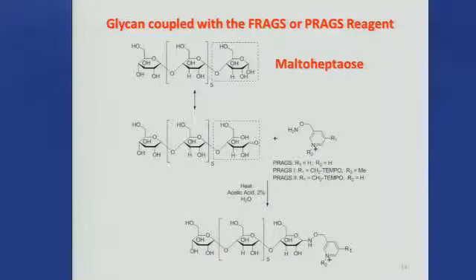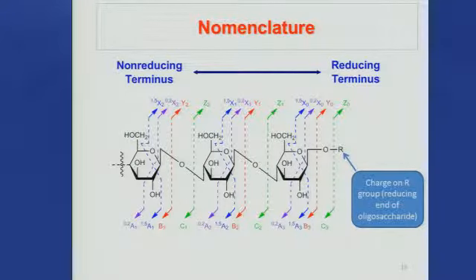So how does this work? We take our reagents, we couple them to the glycan, and in this case, we're just taking maltoheptose as an example. And then isolated in the mass spec, singly charged, and collisional activation then does the rest. So you don't need laser, ECD, ETD, any other attachment. You can do this in any type of mass spectrometer where you can do CID there.